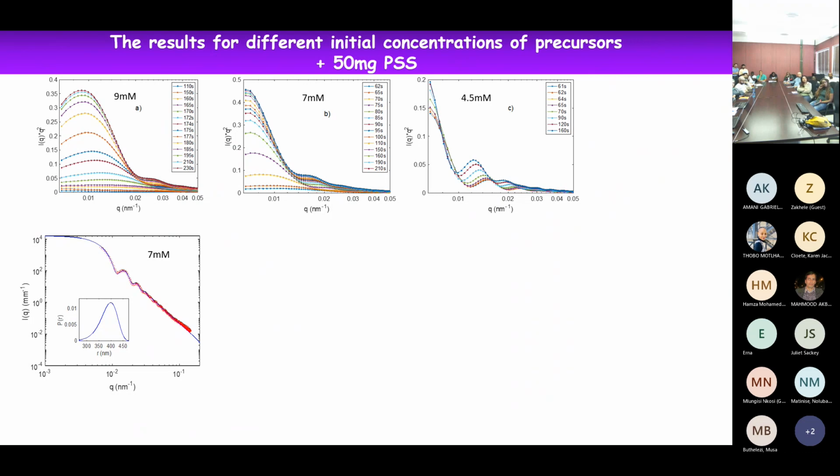Higher the concentration, larger particle. So higher the concentration, that's this one. So you say, in this case, I have larger particles. Wrong. Wrong statement, because I told you the maximum of the Kratky plot is inversely proportional to the radius of the particle. So here you see the maximum is here. So the radius is 2 pi over this quantity, so you can calculate it.